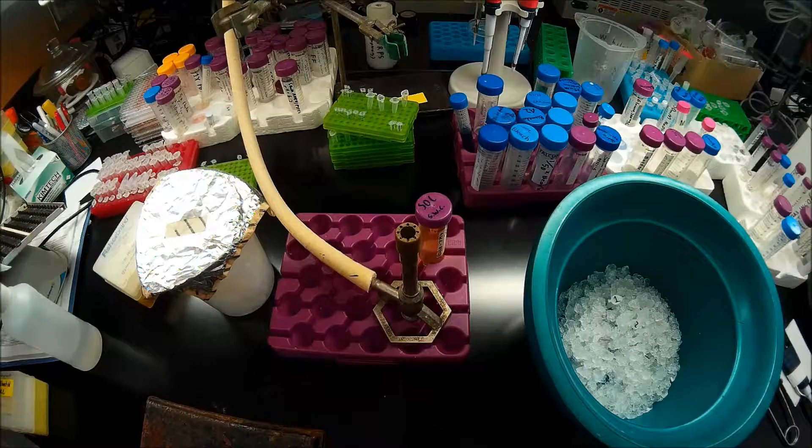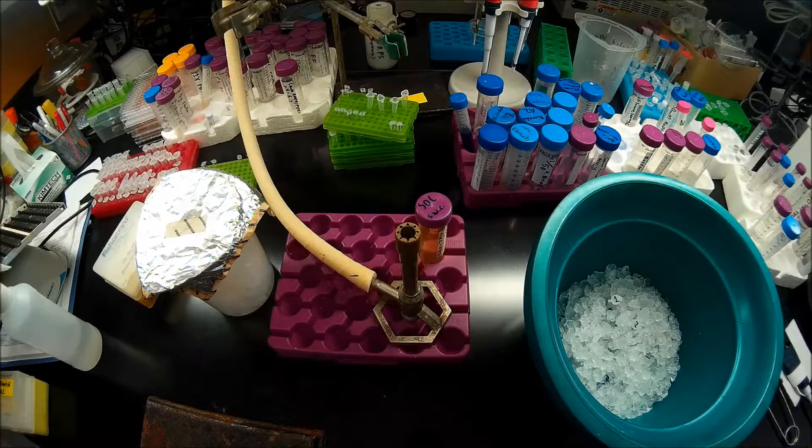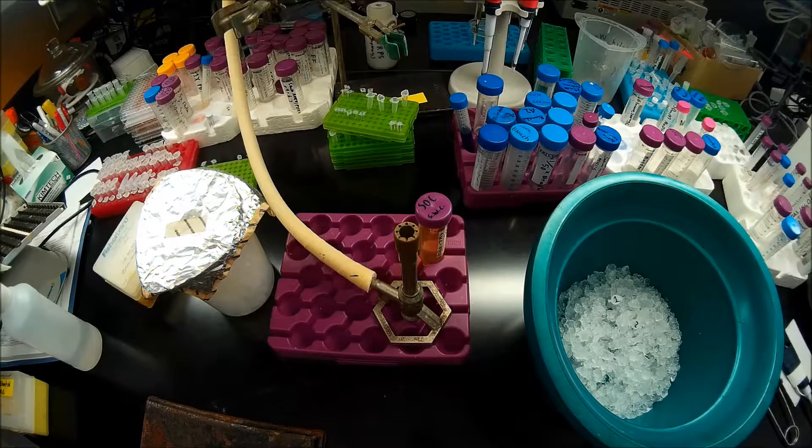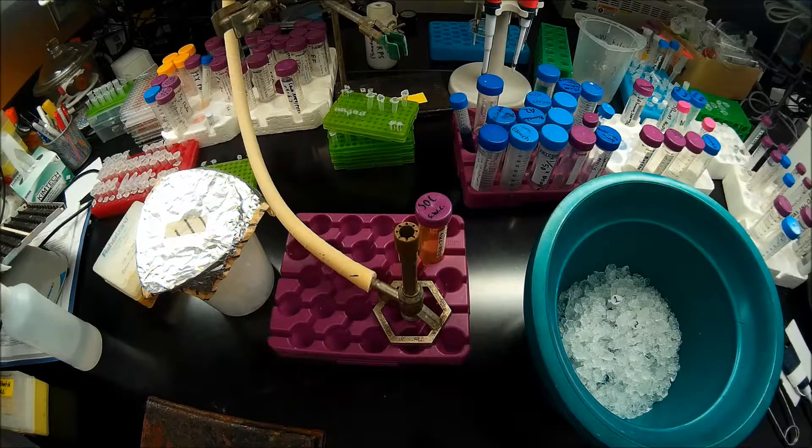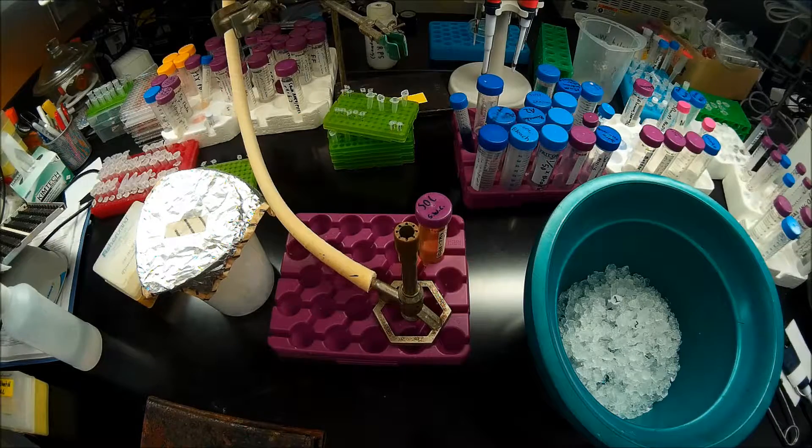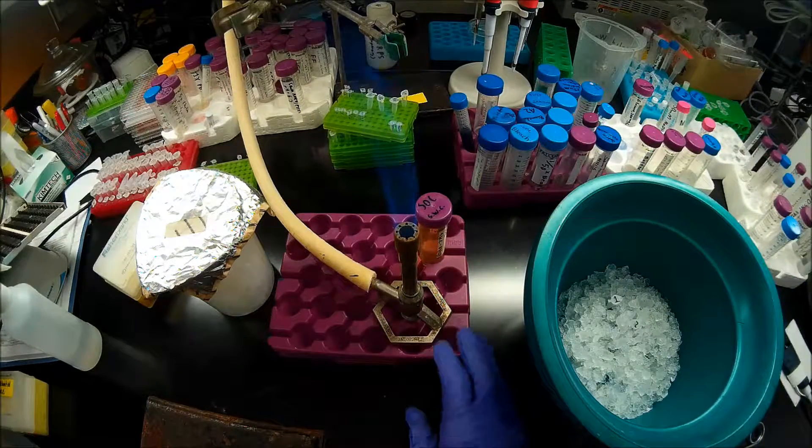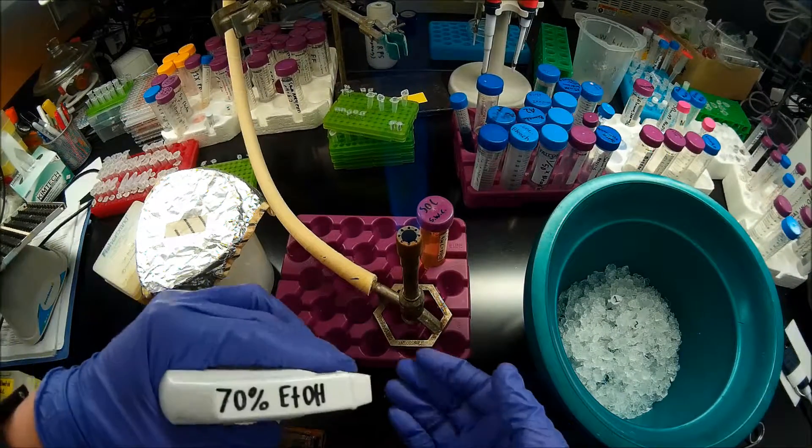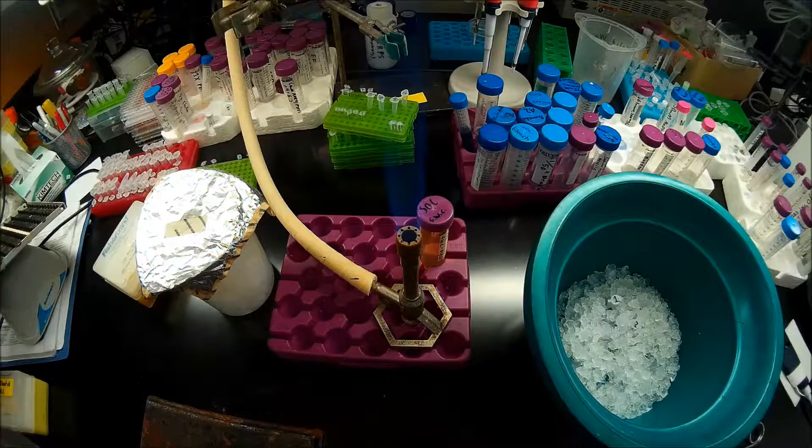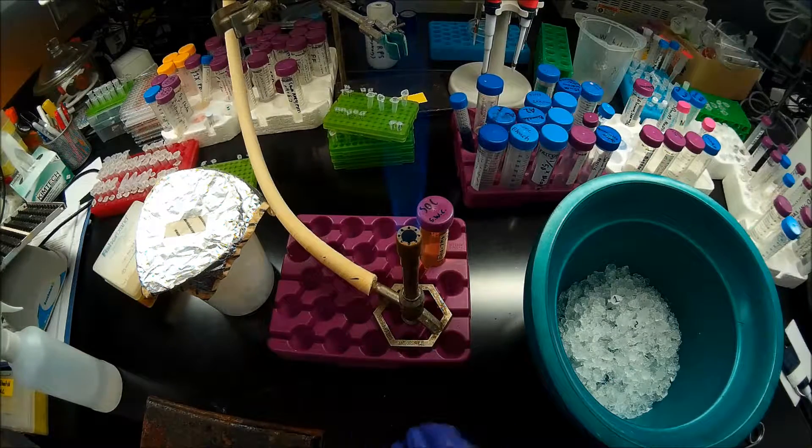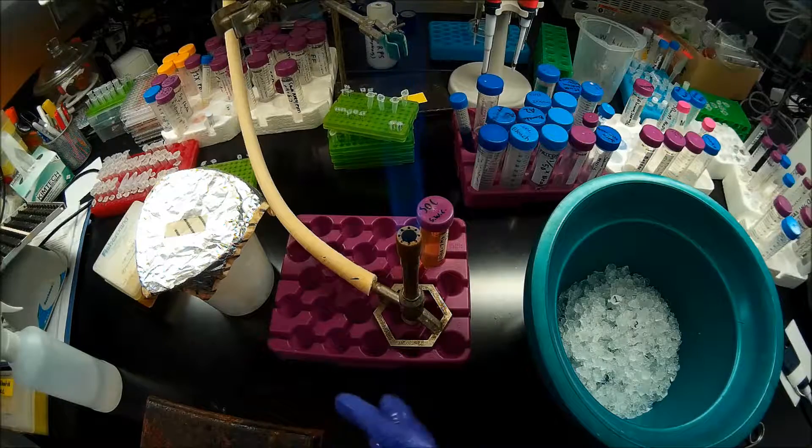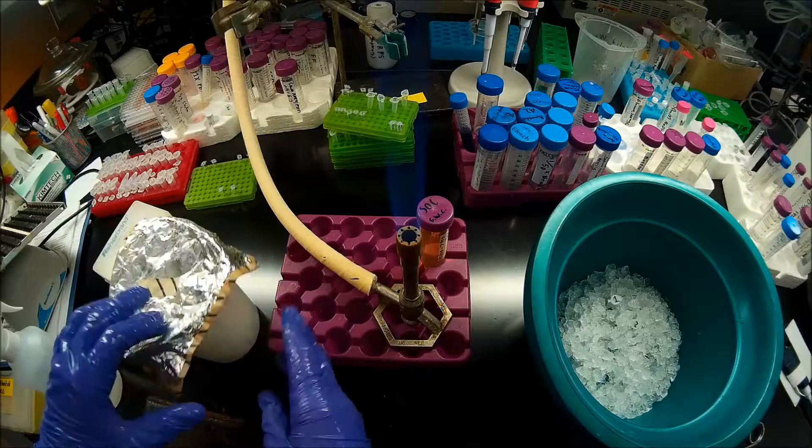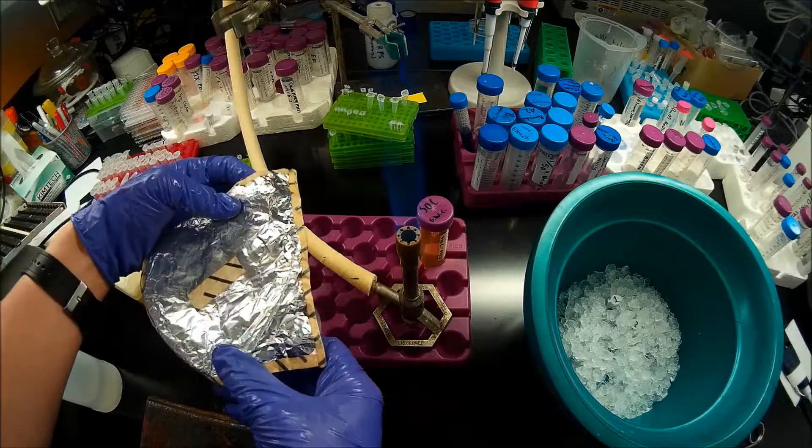But again, that would not be necessary if I was transforming with amp-resistant whole plasmid. So I'm going to turn my Bunsen burner back on. So I'm going to take 70% ethanol and dry wash my hands with that before I reach into this autoclaved beaker here of 2 mil tubes.